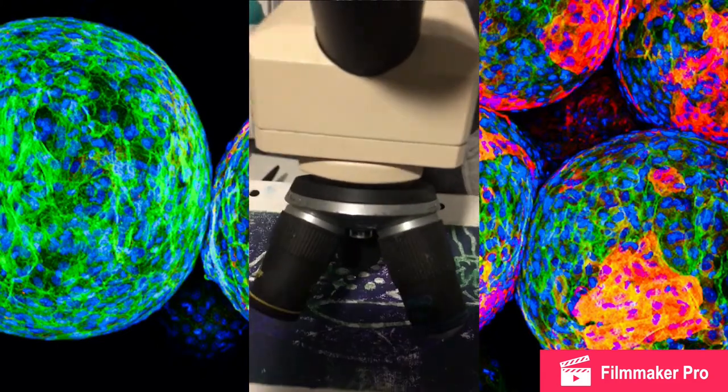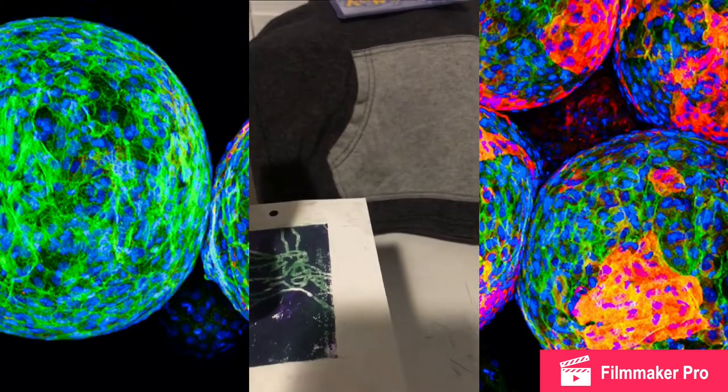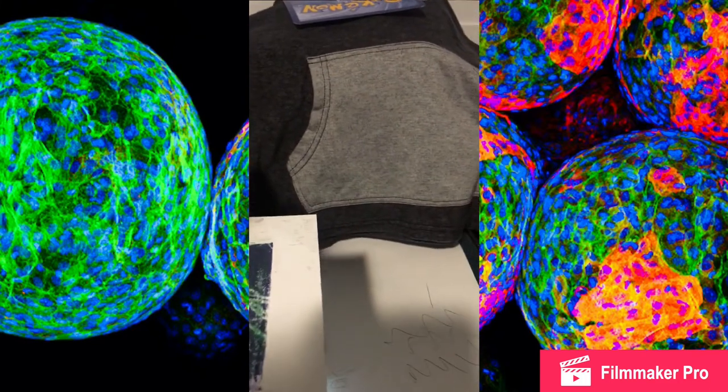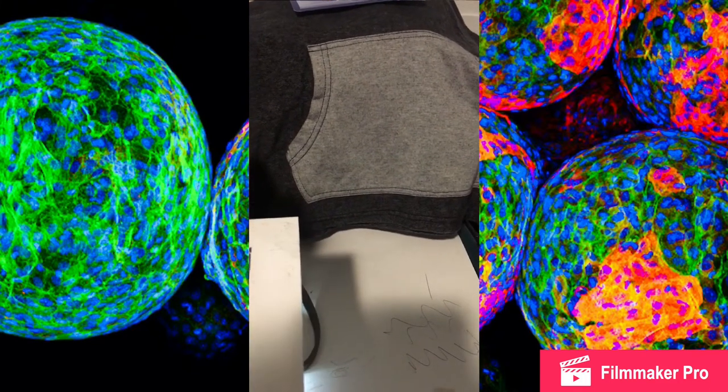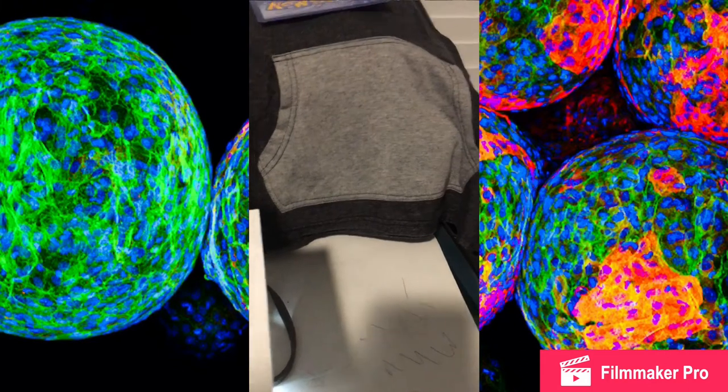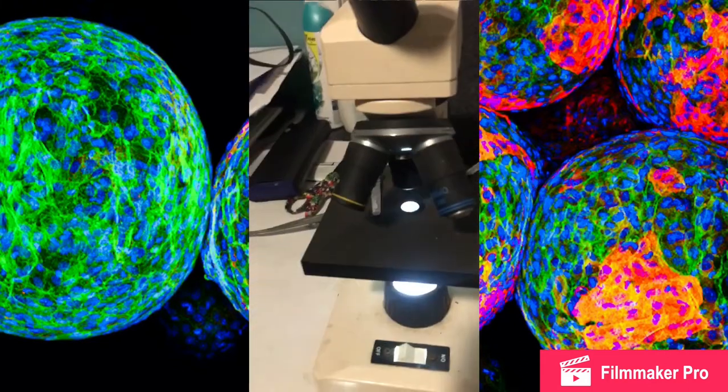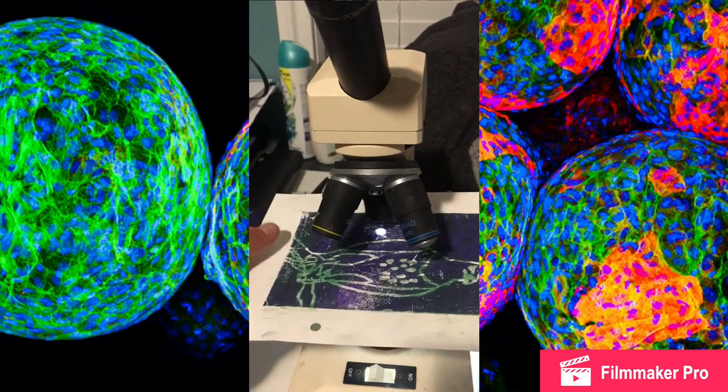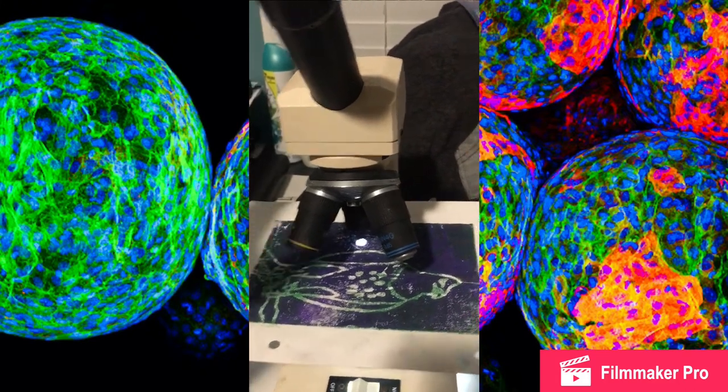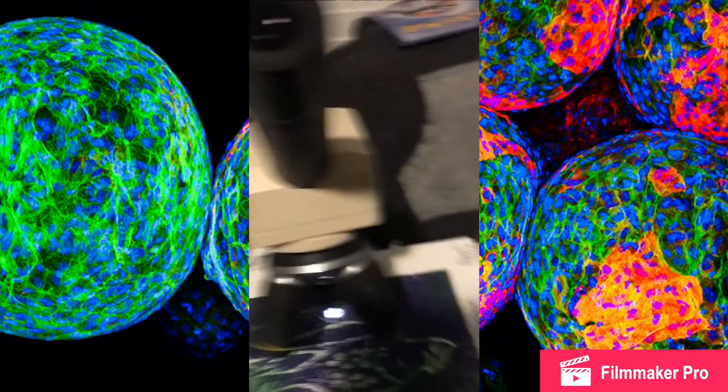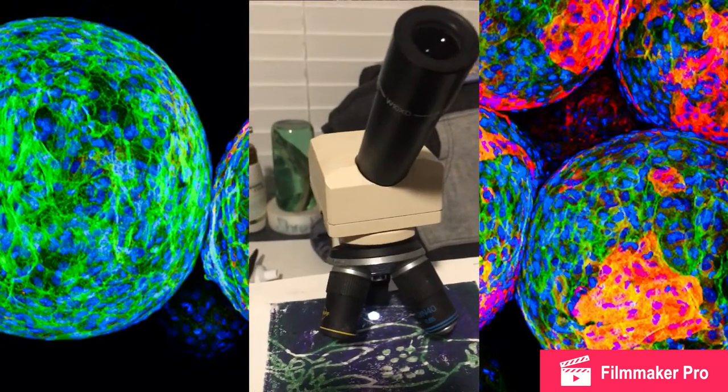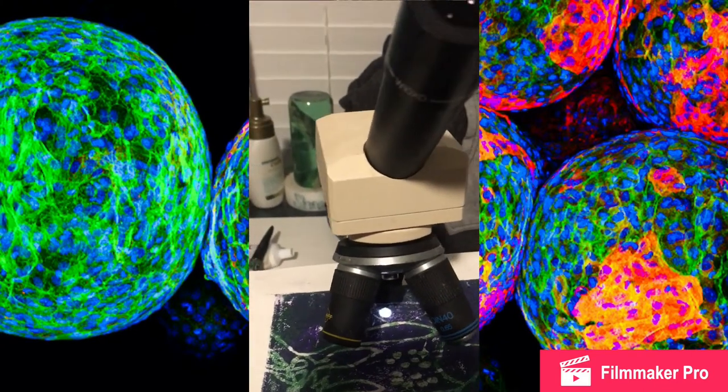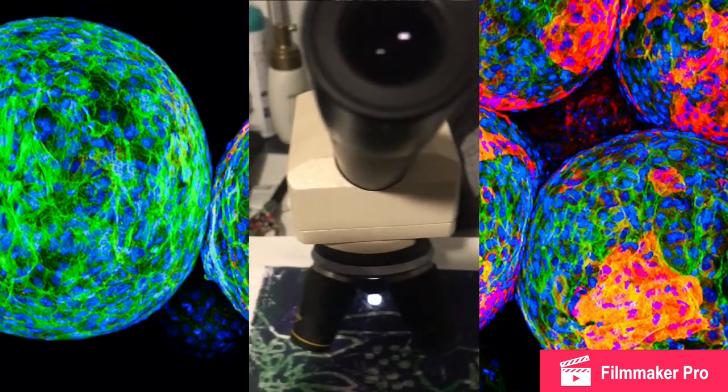Let's turn the light on and see what it looks like. Let me turn it around this way, right there, perfect. Now I'm going to be adjusting it so the camera can see.